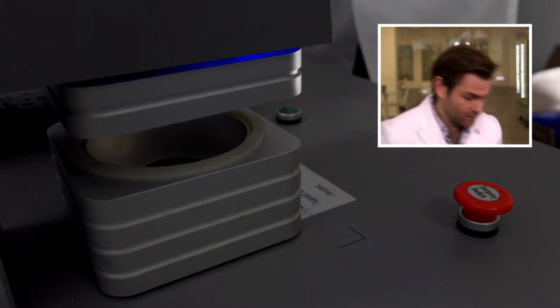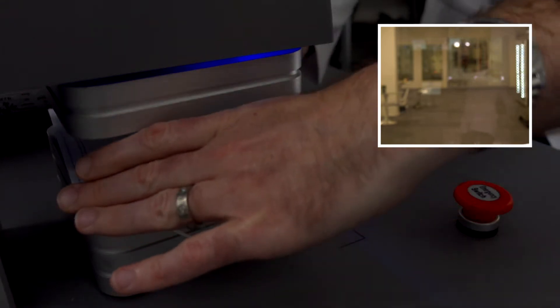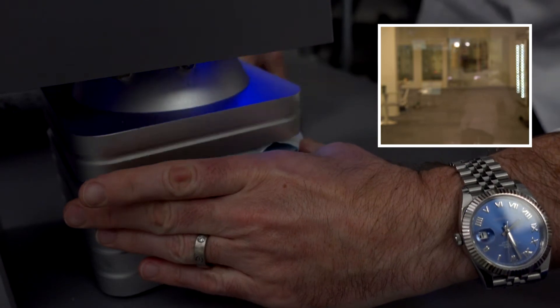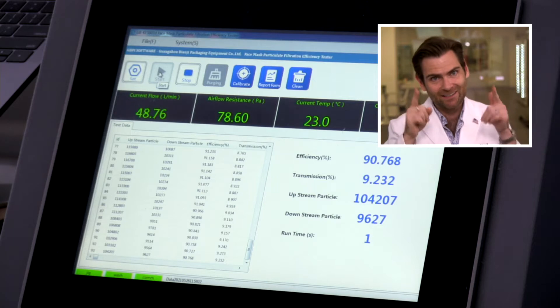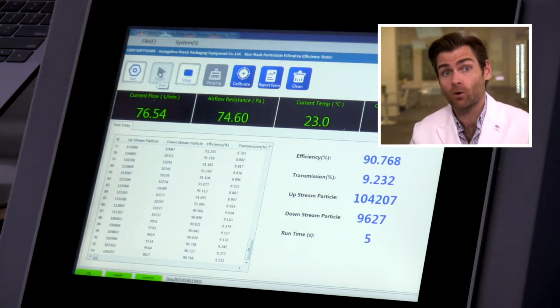Hey everyone, welcome back! We're testing every single mask in the world today. We're looking at masks at Home Depot — that's right, Home Depot has masks you can buy. I found the Safety Pro masks. Let's put them in the machine and see what happens. Here we go, clamped it. Testing it — let's go. This is a particulate filtration efficiency machine.